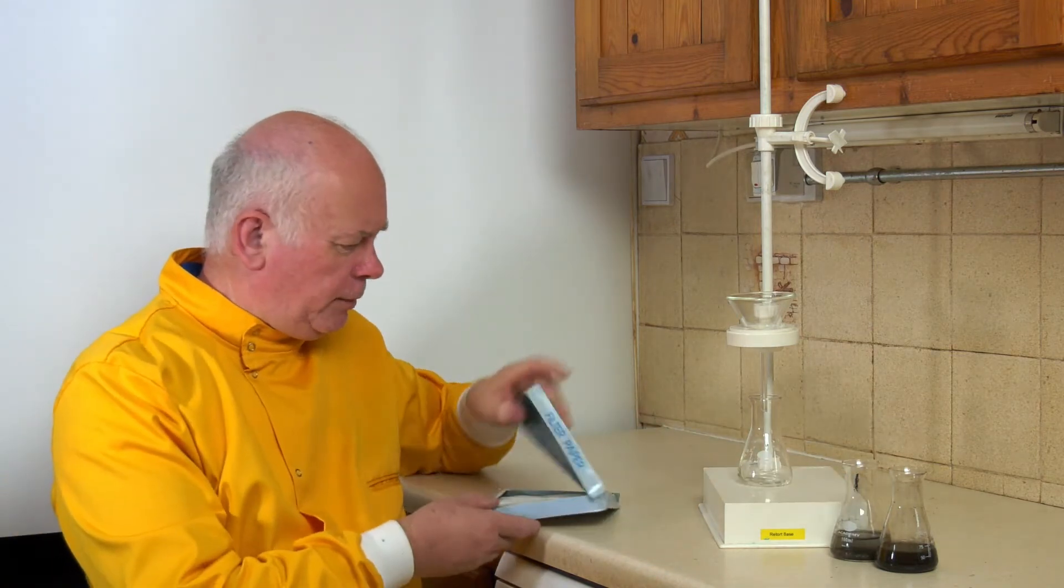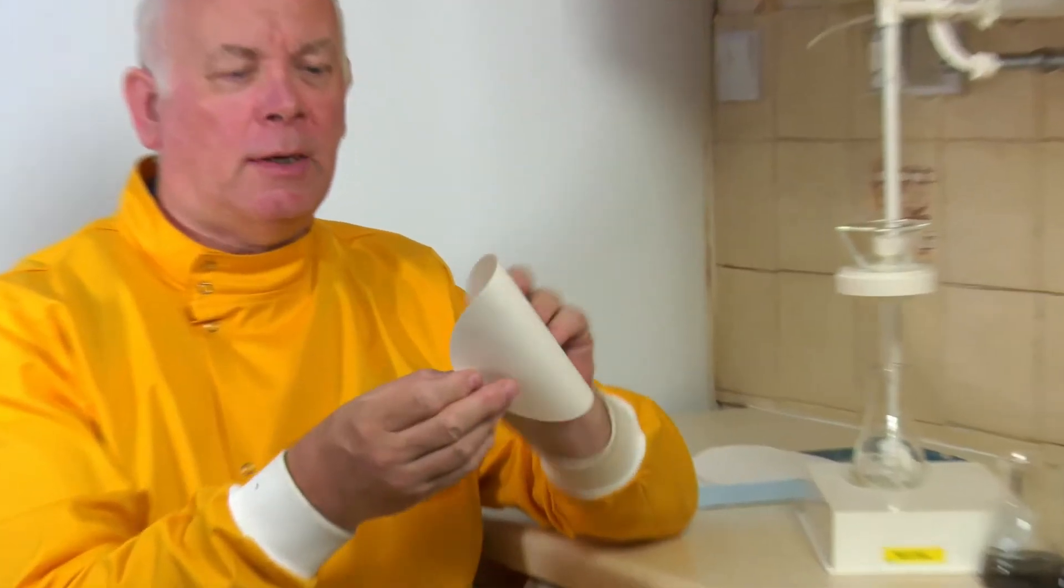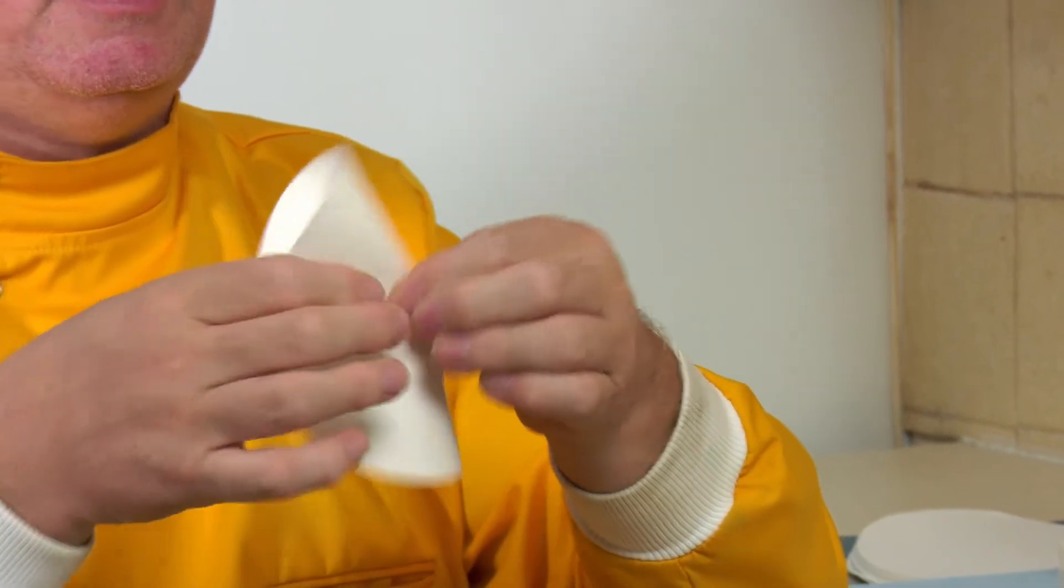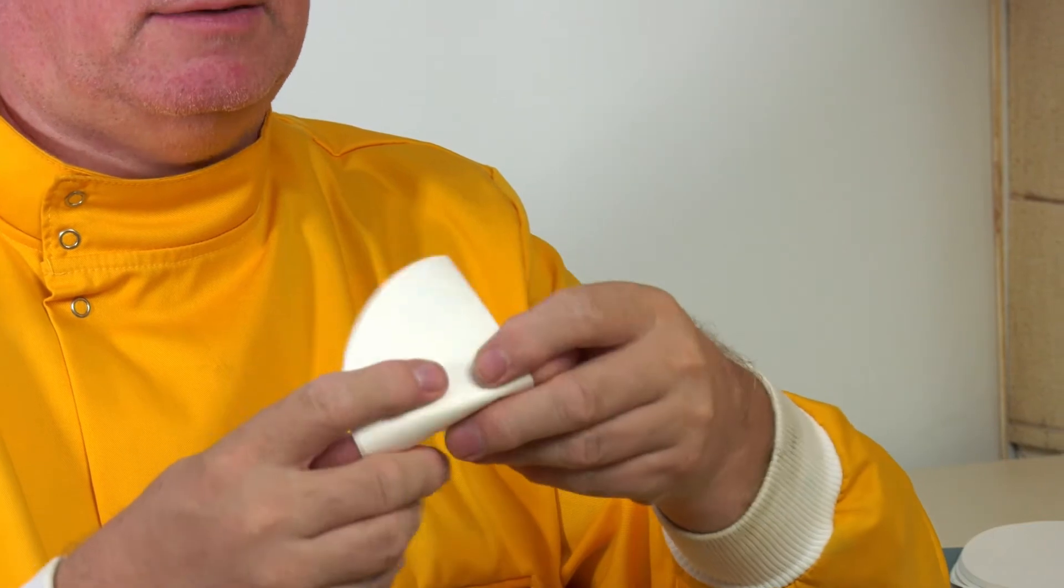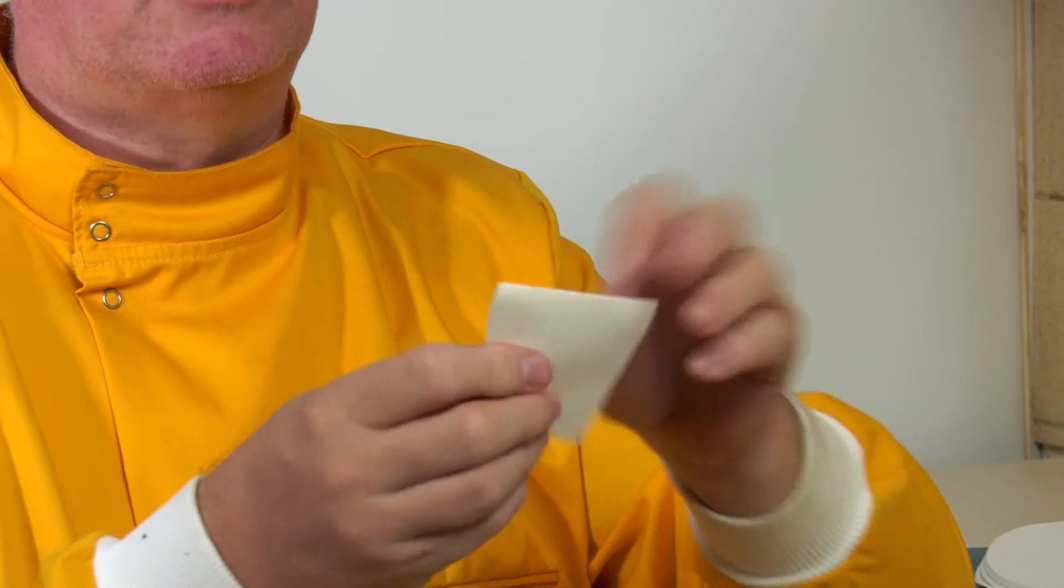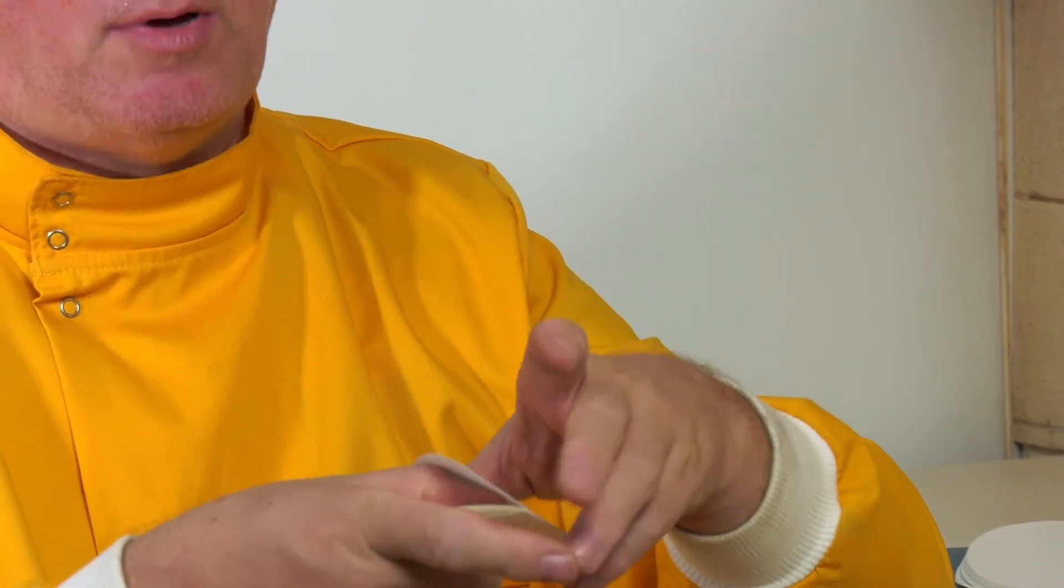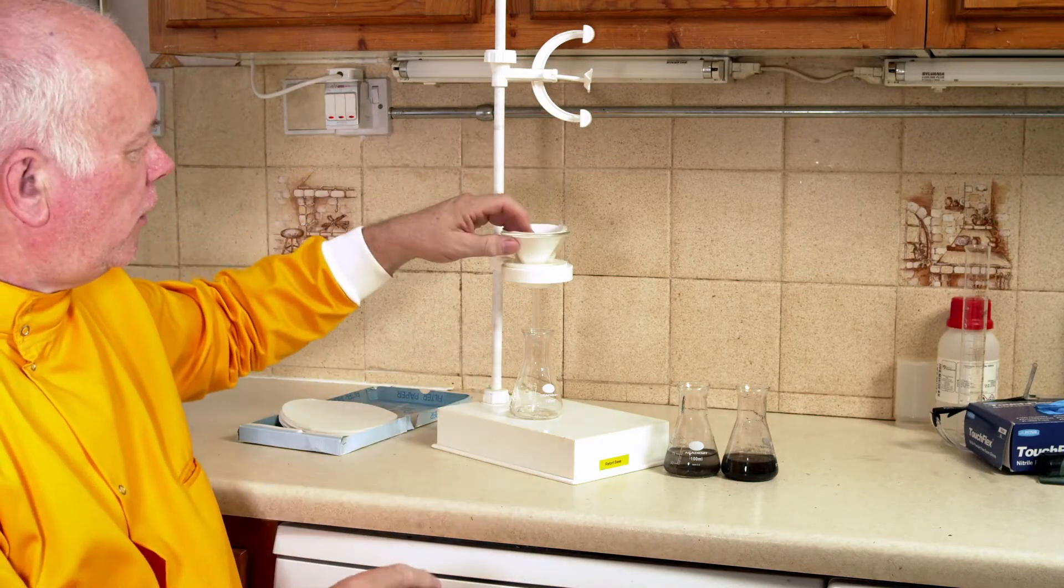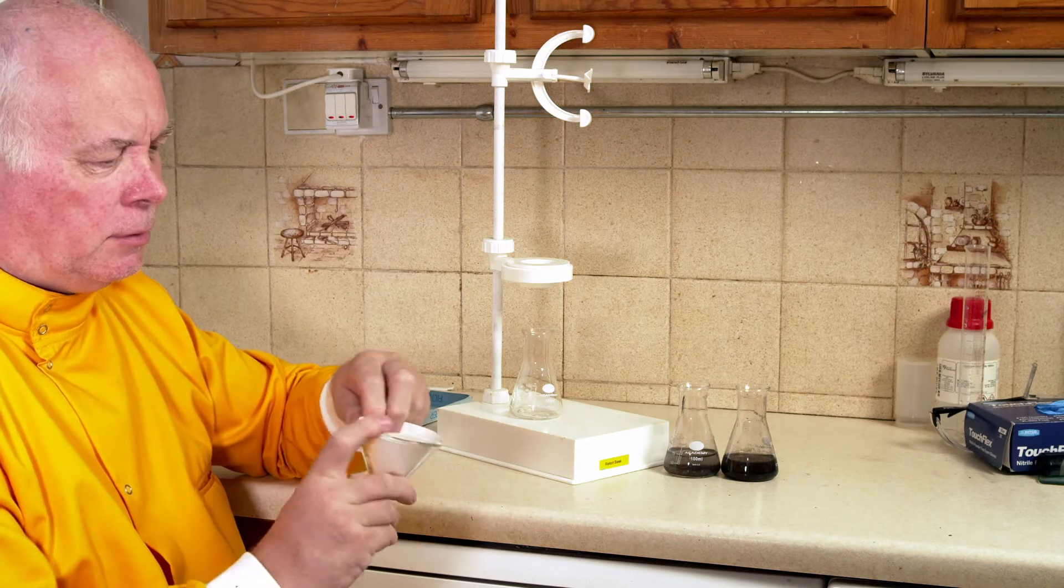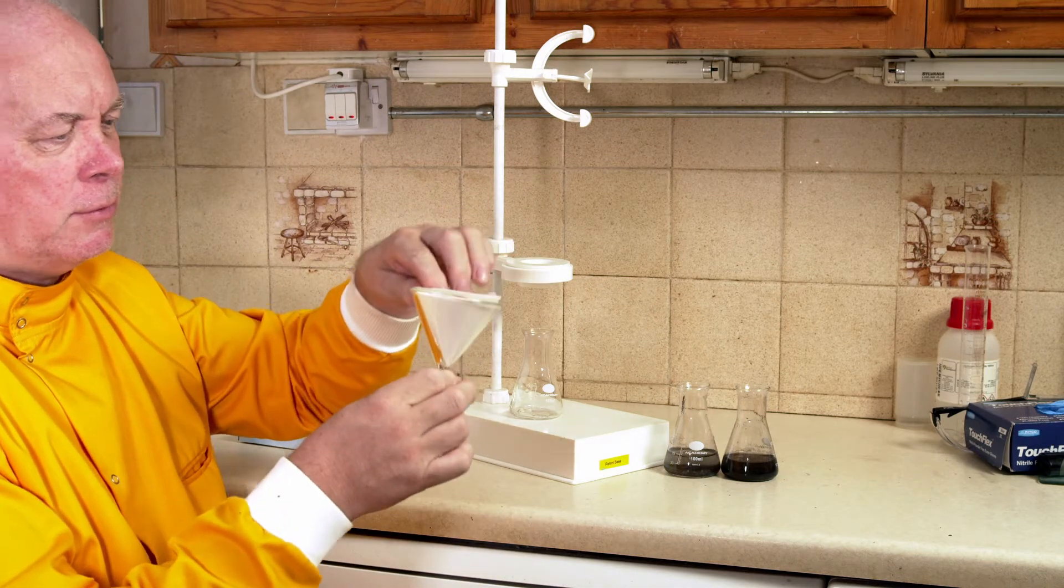And what we need is some filter paper. Now this filter paper can be folded in one of two ways. There's a very quick easy way of trying to do that and that is to fold the filter paper in half and then in half again and that gives you your typical quarter and then if we just open up one of those quarters it makes a cone and that cone fits neatly inside this filter funnel.